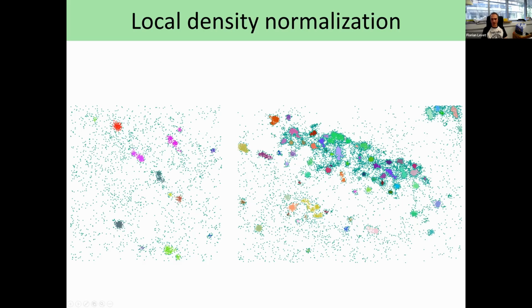And now we have clusters inside the adhesion site and outside. And we have a workflow which is very clear, which is applying twice the average density here and applying twice the average density inside the adhesion site in order to find the clusters. And you can apply that in all your data and you don't care about the localization density of your data.